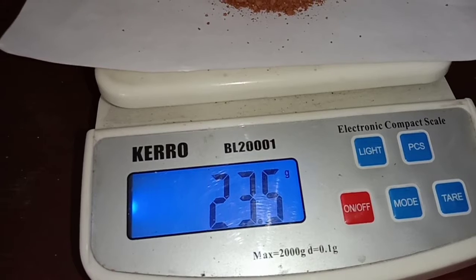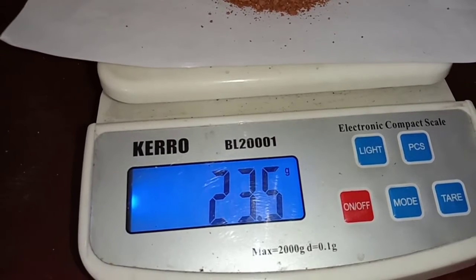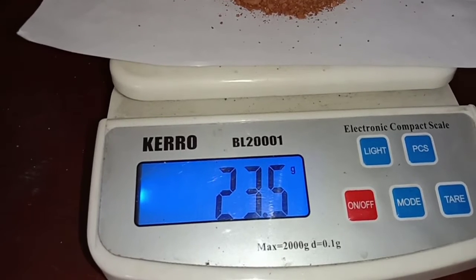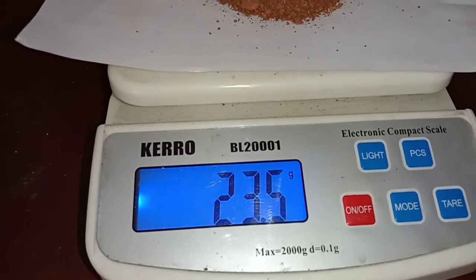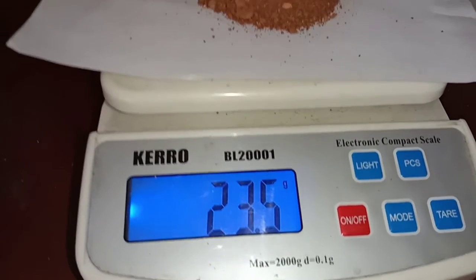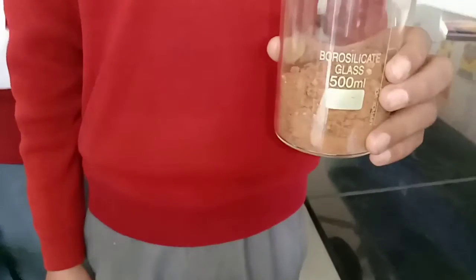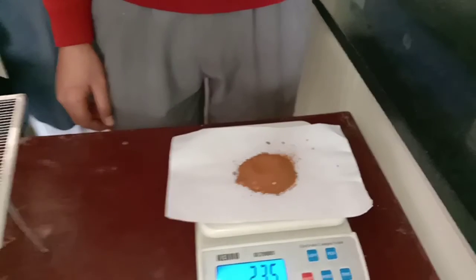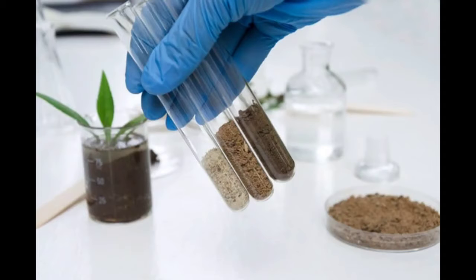The sample where the difference of initial and final weight is larger indicates a higher moisture content, whereas the lower value means the moisture content is quite low. It means from the above observation, it is clear that the soil sample clay has higher moisture content, whereas the soil sample B, that was our sandy soil, has low moisture content.